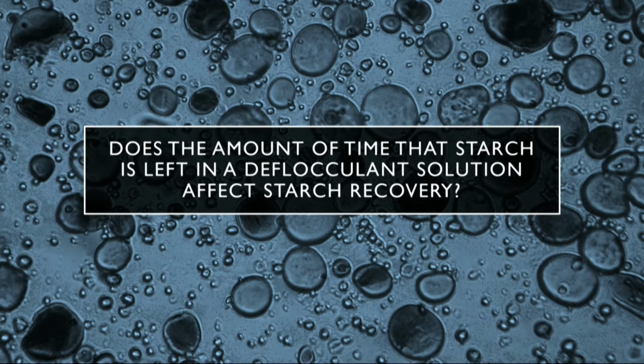To better understand the effects of Calgon on starch granules, we conducted the following experiment to determine if the amount of time that starch is left in a deflocculant solution, in this case Calgon, affects starch recovery.